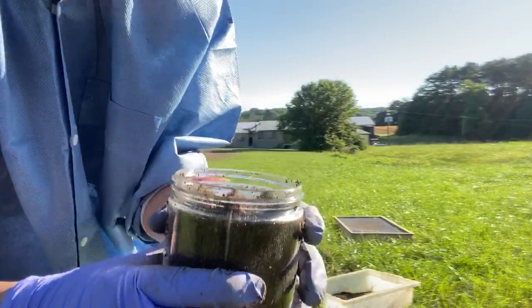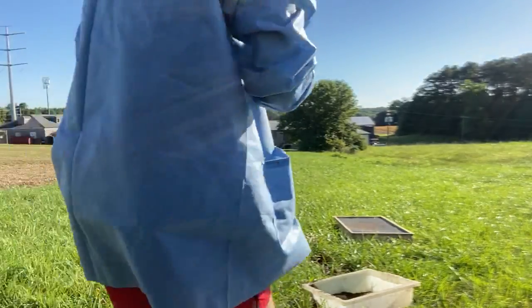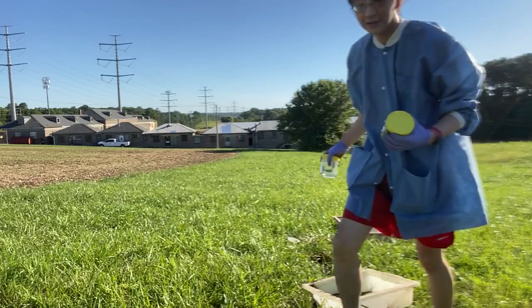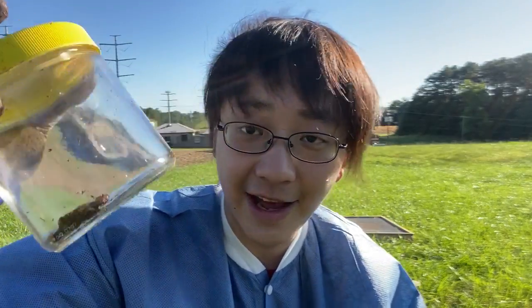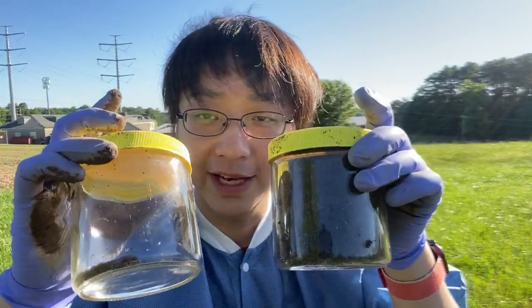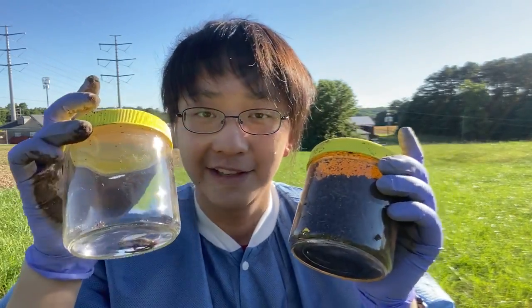So this is soil from the same site. Finally, we have the earthworm samples, which are not enough for one analysis, but I just show how I do that. And here's the soil sample. Finally, we just take the soil and earthworm samples to the lab to analyze the concentration of DDT in these samples.